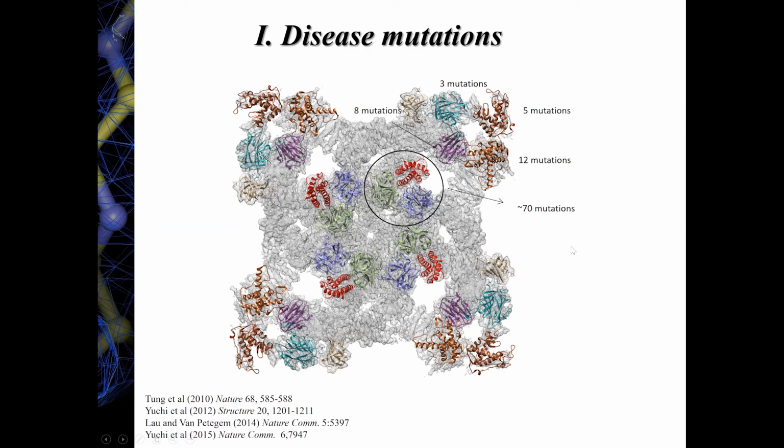And the bottom line is that we found that many disease mutations are clustering at the interfaces between these different color domains. And when we compared structures, we saw that in many cases, the disease mutations were triggering conformational changes in the isolated pieces that we crystallized. Now, of course, there's a limitation to this study. It's because we're only looking at fragments of the ryanodine receptor. And so if you really want to understand the complex effect of a disease mutation, it's important to look at it in the context of the full protein.